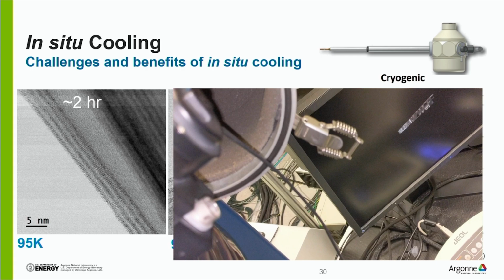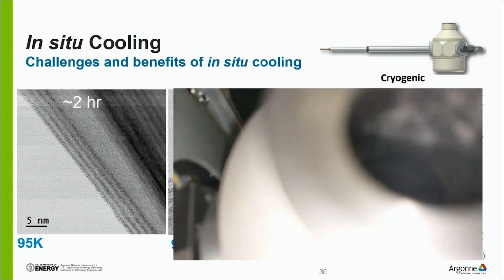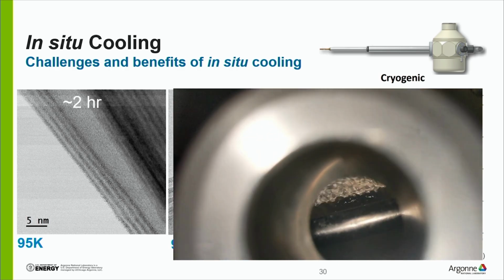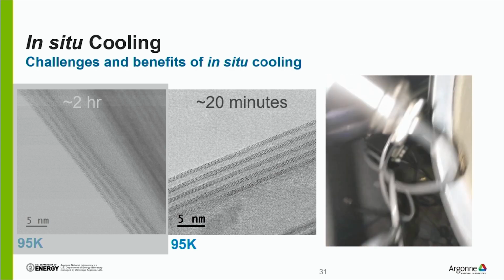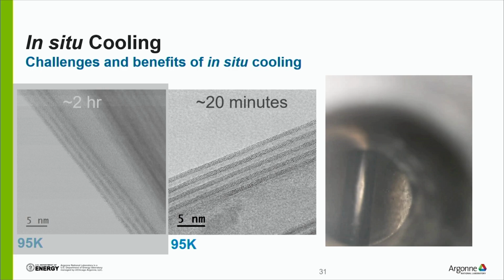I have a couple of videos. This is me on the microscope looking at the liquid nitrogen levels, and on the right is an image that you would get. Again, you're at liquid nitrogen temperatures, but even with stable temperatures, you still have a lot of thermal vibration in the material. What you really need is something like this, where the liquid nitrogen level is sufficiently low that you have very low vibration, but not so low that the whole sample stage is going to start heating up again and expand. This really reduces your window of imaging. Loading in your sample, finding the best spot, and optimizing your probe takes some time, and that limits the window in which you can get really nice atomic resolution imaging to about 20 minutes. So there were some tough times as a grad student.